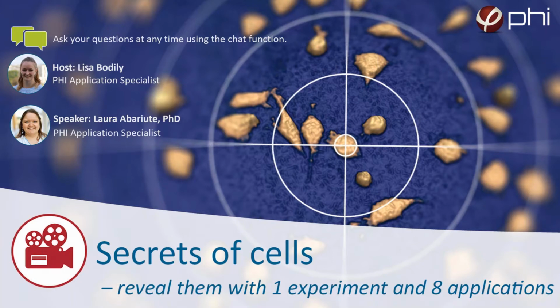Okay, thank you, Lisa, for the introduction, and thank you, everyone, for joining us today. As Lisa has mentioned, I'm going to be talking about how you can reveal your cell secrets, because we know they're hiding them when they're left alone inside the incubator. I'm going to be talking about label-free live cell imaging applications in research.